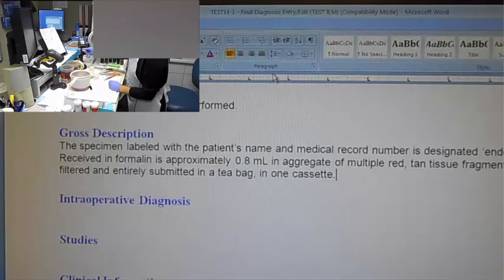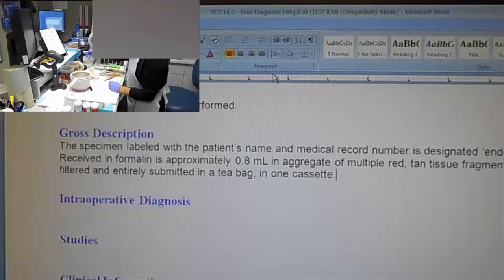One important thing to see here is that this is only a single part case that there is no A and B, and there's no A and B on a microscopic examination performed. That'll be important for the last case.